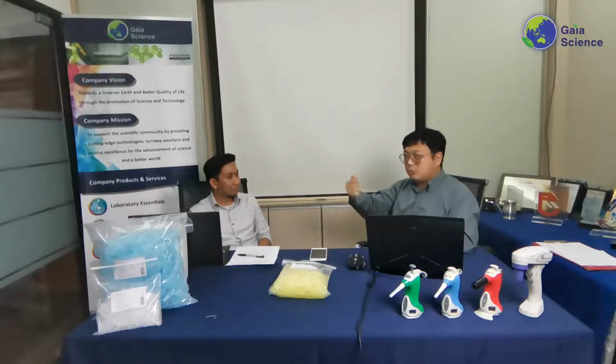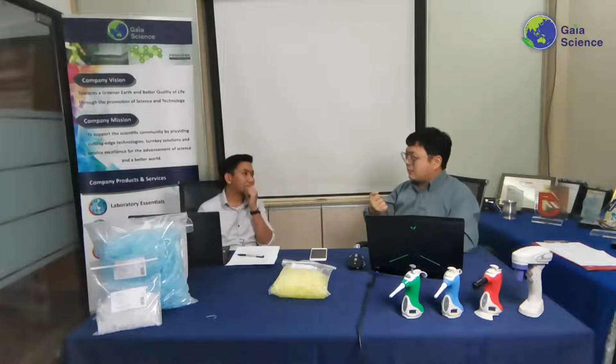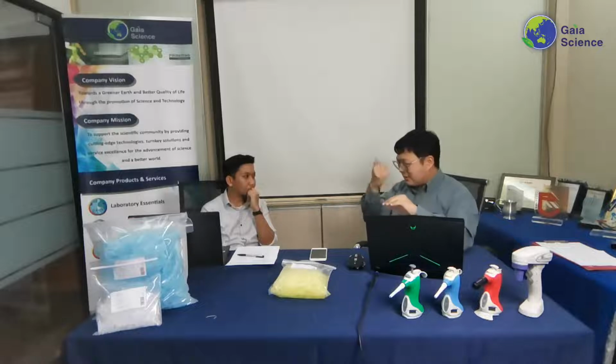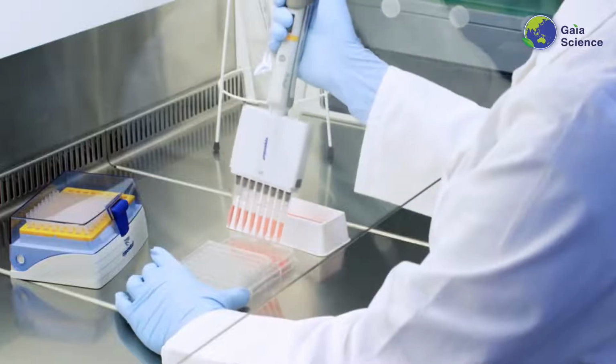Most of the time we use short tips, and that is good enough because most of the work requires very short hand movement. Most of the time we can be very close to the plates, and we can precisely seed for cell culture.